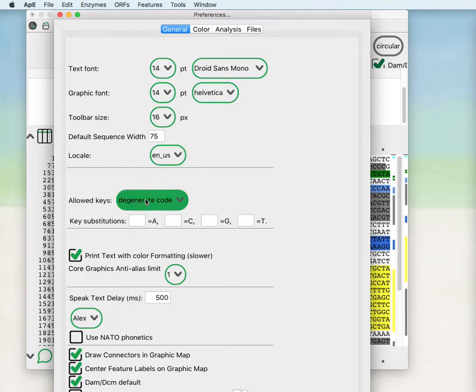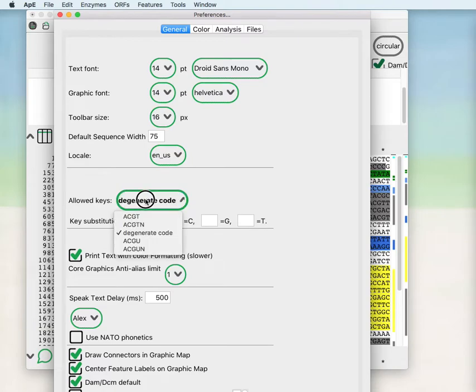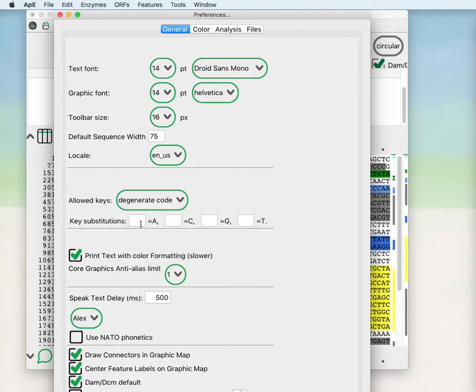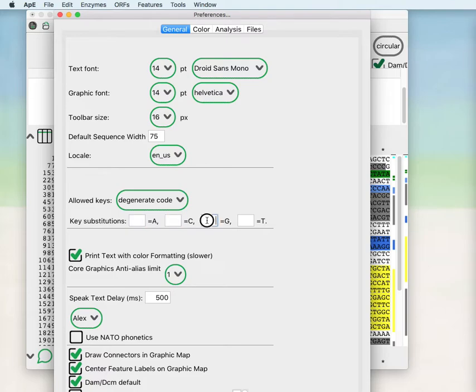You can change whether you can type in any base in the degenerate code or you can limit the input to these functional sets. If you would like typing in a different set of keys, you can change so that you will translate any particular key press to any of these A, C, G, or T.